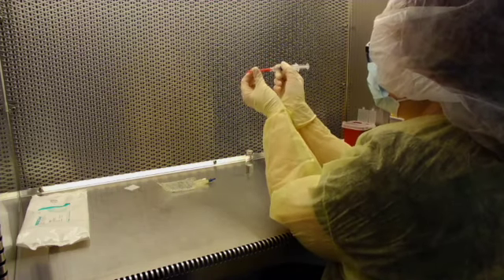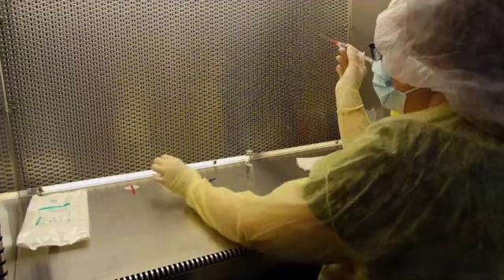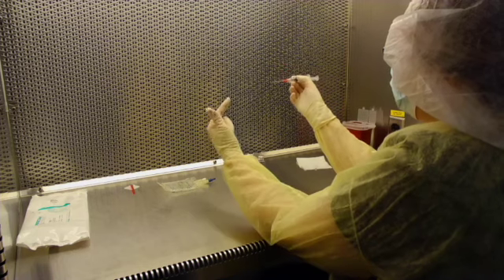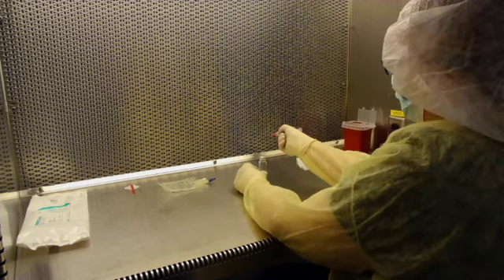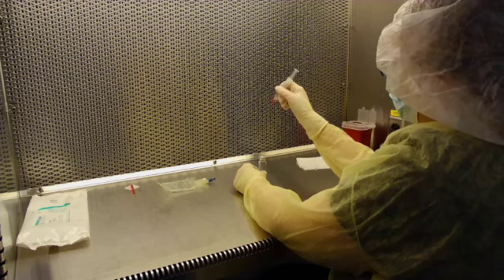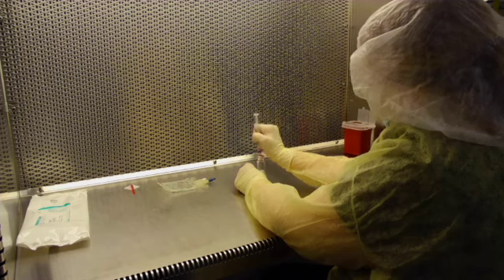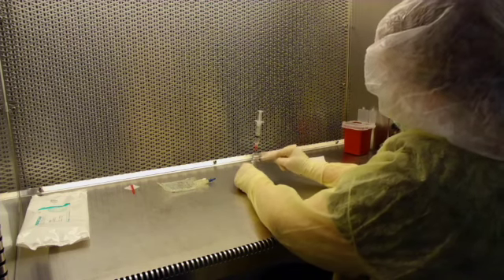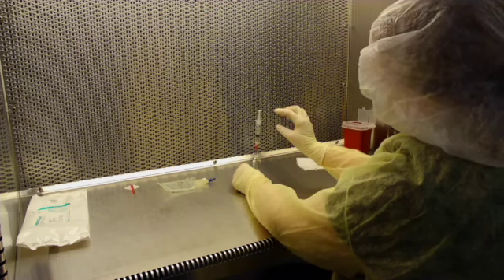Best practice, remove your needle cap, with the cap opening facing your HEPA filtered air on the alcohol swab. This is a demonstration using the red blunt fill needle, which means I'm going straight in at a 90-degree angle, not from a 45 to a 90 if I was using a pink or beveled needle. Never allow the rubber septum to meet the needle hub, always seeing silver of the shaft.